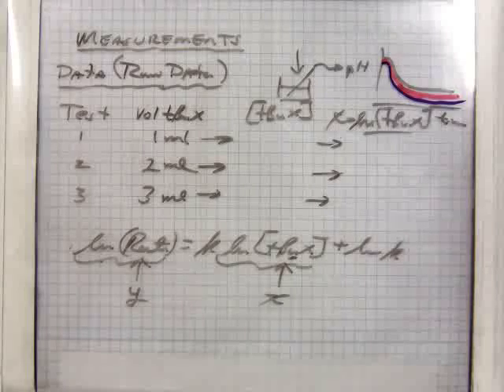And this is your hydrogen generated per 100 seconds, so I divide that concentration by the time to get a rate. So this is like miles per hour, except we use moles per liter per second. And I've got a rate now, and then I take the Ln, and those are the numbers you plot. And so we have an X, see these came down here, and these right here are down here. And so I plotted these, X against Y. And I got this number right here where it intercepts. And I'll show you how the Excel program, if you use that, will automatically plot and give you the equation. And this is your Y-intercept right here.